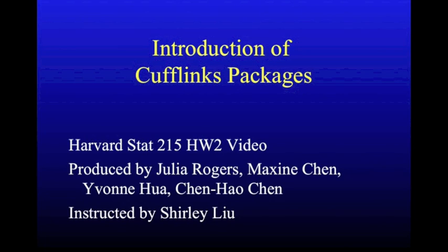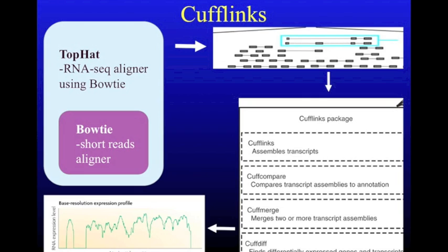Okay, so here we're gonna introduce a very important yet useful program for RNA-seq data analysis, and that is the Cufflinks package. After using TopHat to align the reads to the reference genome, you might then want to further infer the abundance of the transcripts.